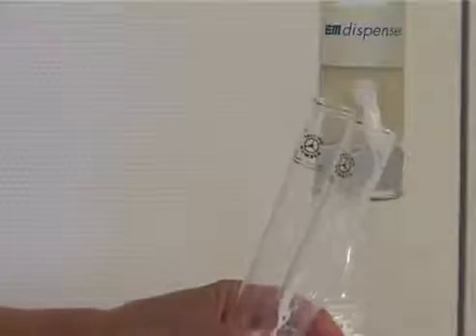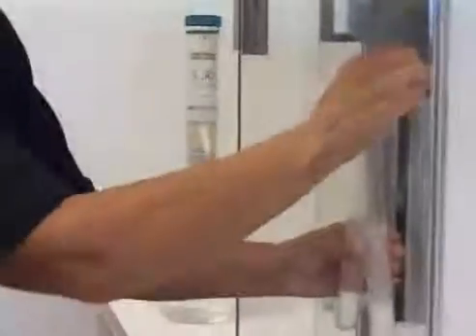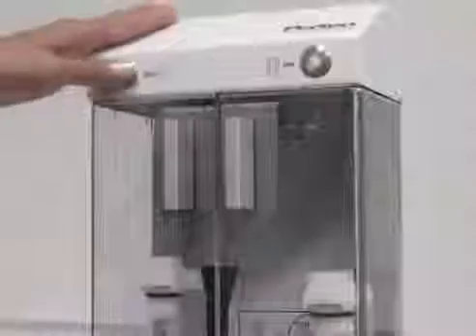Add 25 milliliters of pure water using the dispenser. For a repeatable way to mix the sample, put the tubes into the machine and start the mixing.